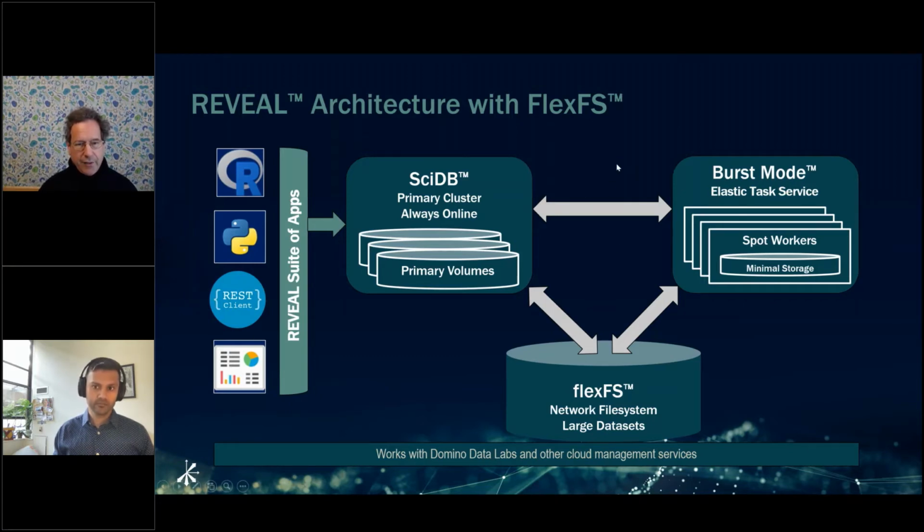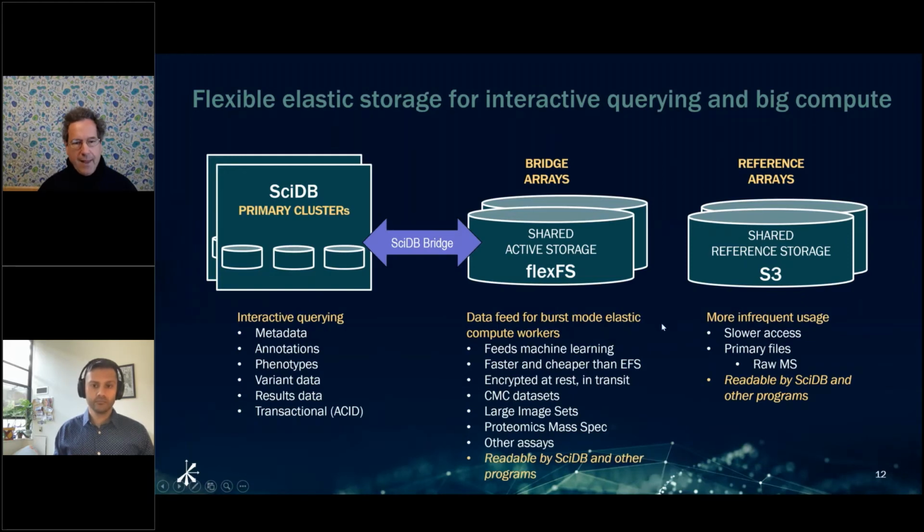the ADF format. And then we've also developed this flexible storage system, which is called FlexFS, which sits on top of S3. It's a file system that has POSIX compliance and scales linearly with the number of workers, which is why we designed it, because there's really nothing out there that allows you to do this kind of scaled analytics in the cloud. And then just to be explicit, where you would store the large data sets would be in Flex, as well as in the shared reference in S3, so for data that you wouldn't encounter very often.